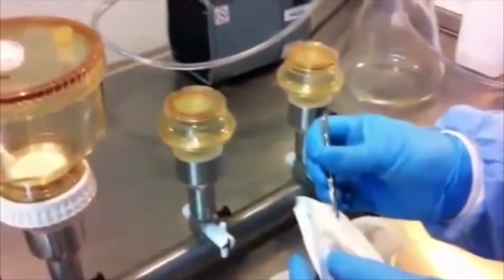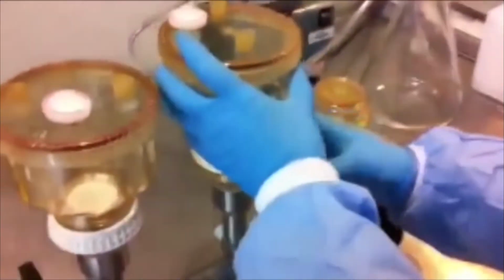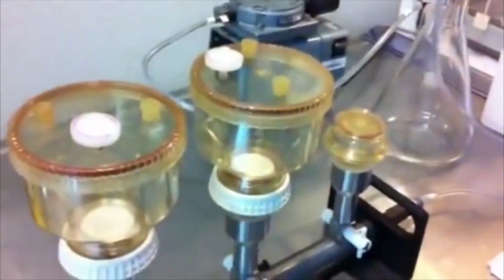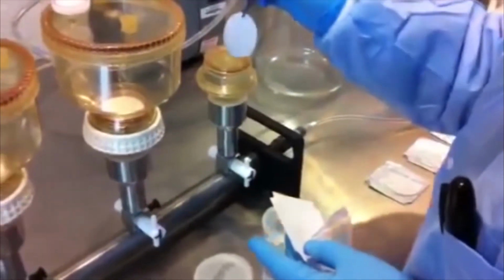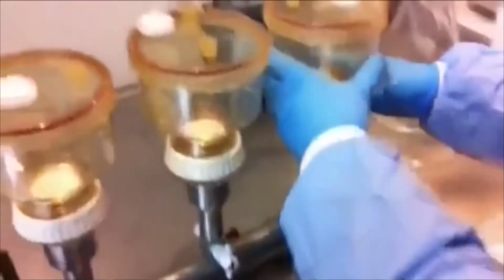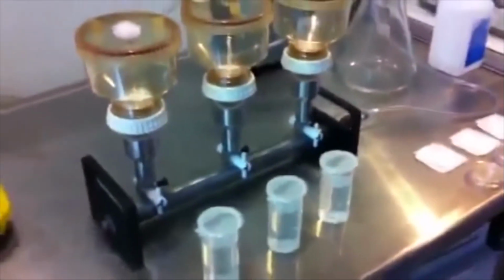Aseptically removing the sterile filter, placing it onto the frit, and attaching the funnel. And here the last filter. And the funnel. And lock it in. So now we have the funnel set up on the manifold.